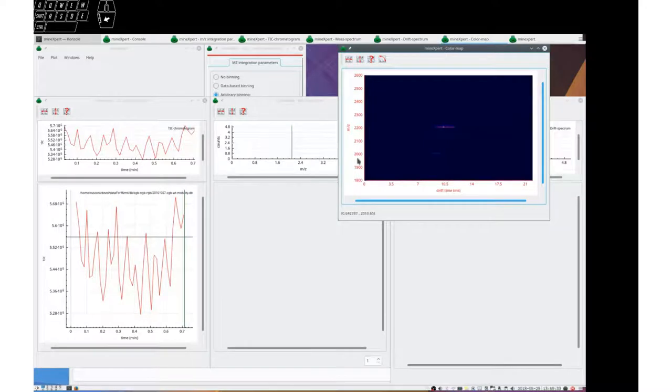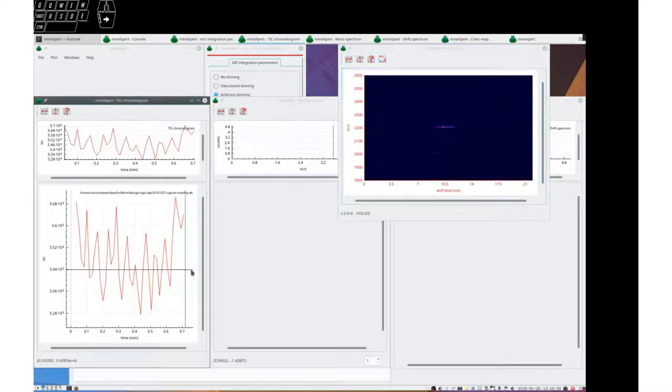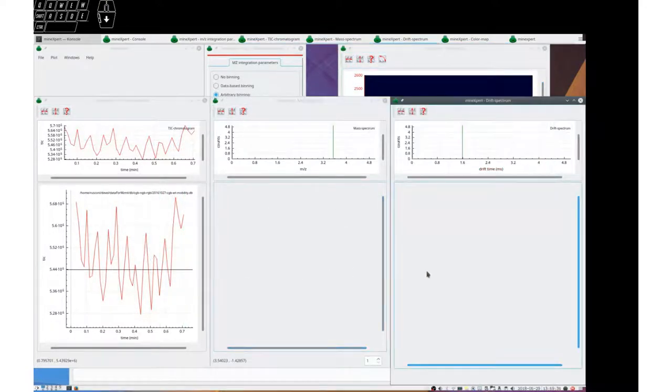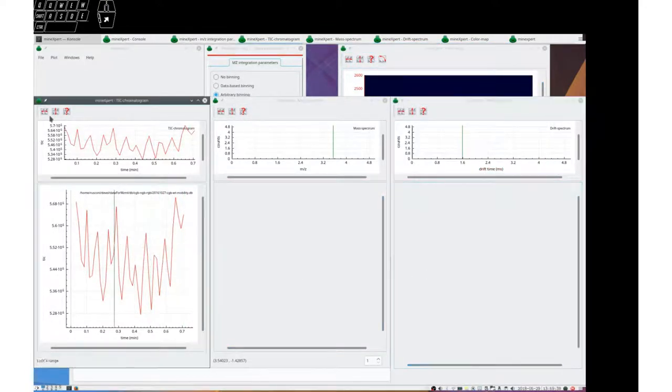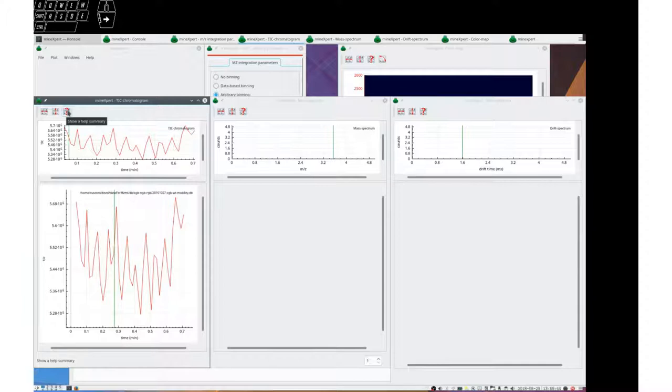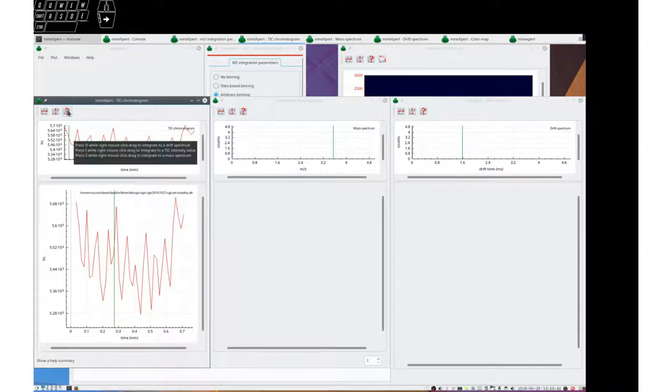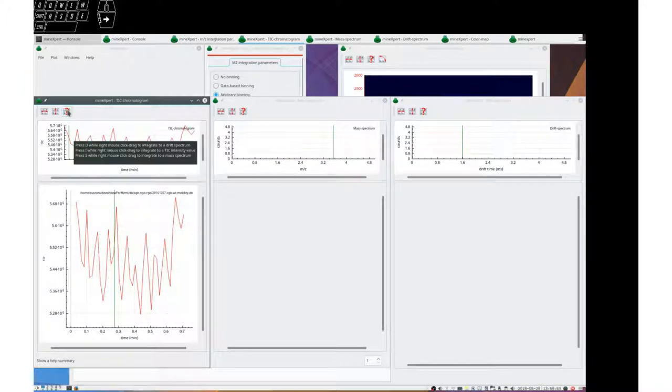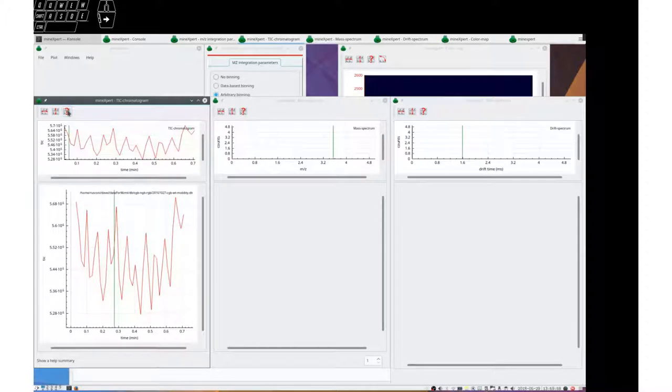Each of these windows has a toolbar, and in that toolbar we have an interrogation mark button that shows a help summary. To integrate to a drift spectrum, press the D keyboard key while right mouse click drag to integrate the spanning region. Let's do that.